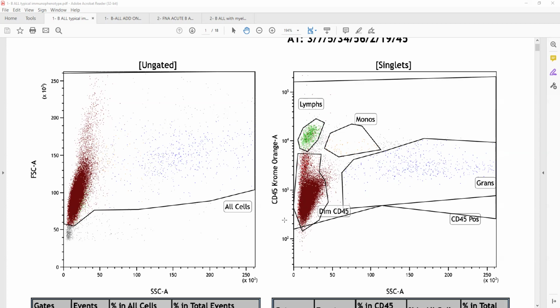T lymphoblasts, have TdT expression. So TdT is an immature marker associated with lymphoblasts, whether these are B lymphoblasts or T lymphoblasts. However, you have to be careful because there are rare cases of B-lymphoblastic leukemia that lack TdT expression. That's why you always have to take the general picture.